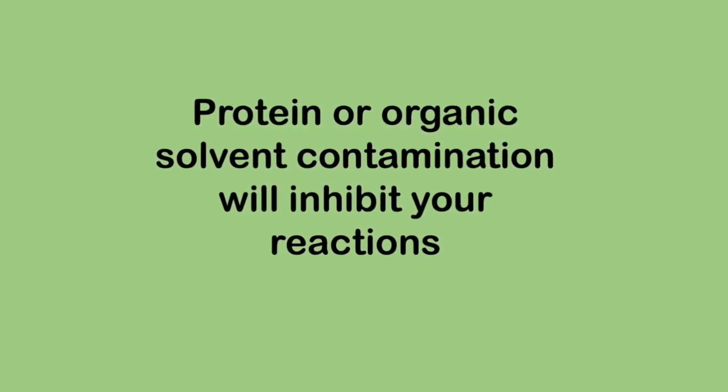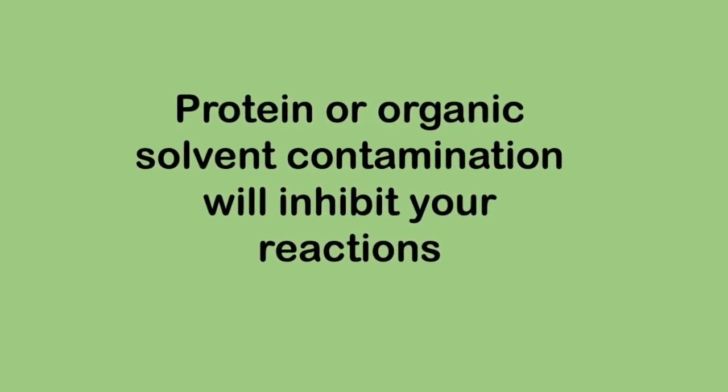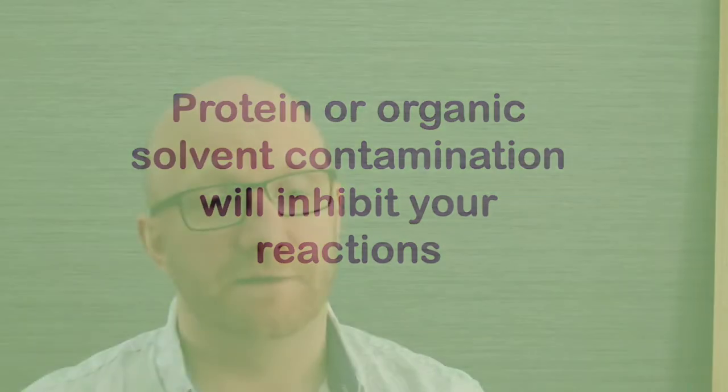Any contaminants could have a negative influence on all the further reactions you do, the RT-PCR steps. Okay, so if you're determining the concentration of your solution using spectroscopy, then there are two easy to do measurements that will give you sort of an early indication of how much contamination you have.